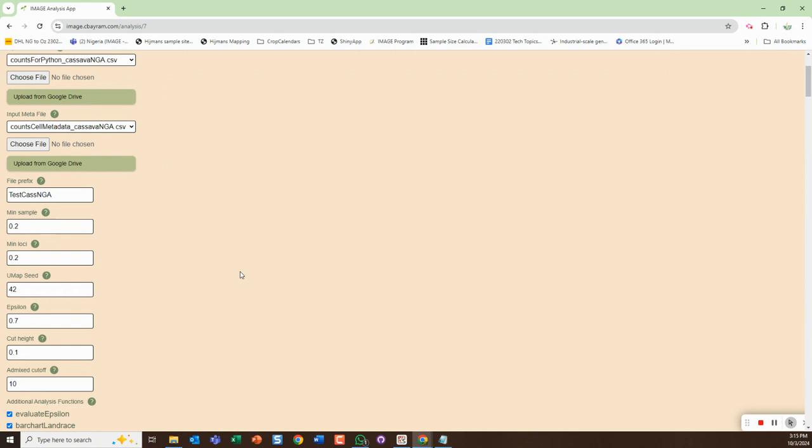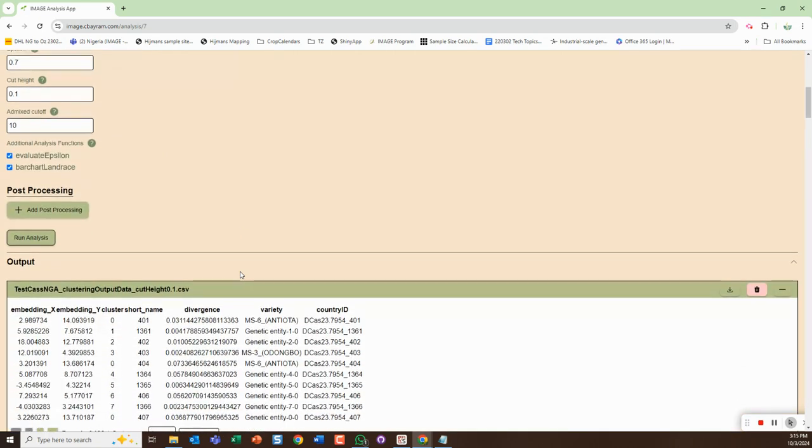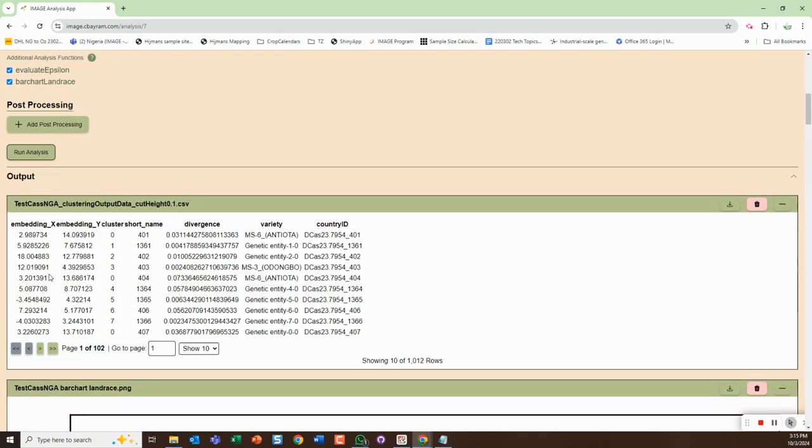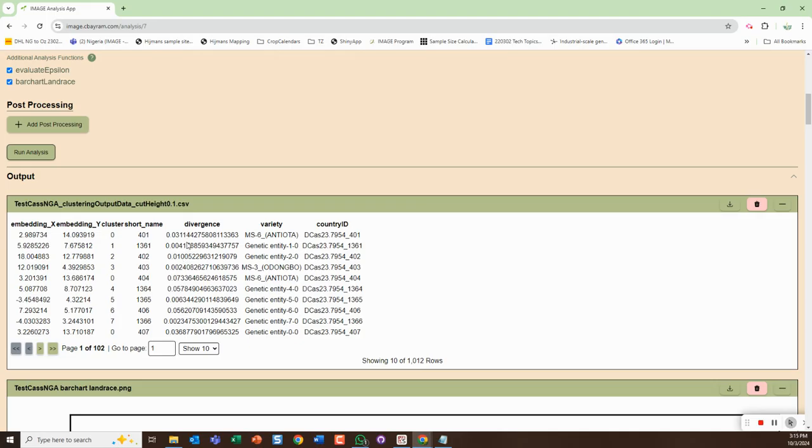Here you can see it gives you a little bit of a preview of what was outputted in terms of the dot CSV. It has the embedding for the UMAP, tells you what the cluster is, tells you what short name was used, gives you the divergence - maybe we can round this in the future by updating the Python code.